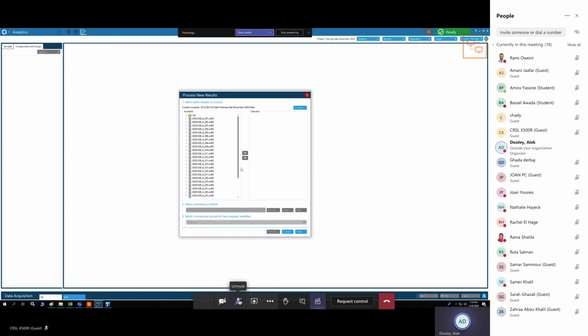I'll give you a hint. Is the chromatography the same? Do you mean integration? Integration will be, yes, perhaps a little bit different, but there is one big difference that will change if the chromatography is not the same. Anybody think what that is? Is it the retention time?